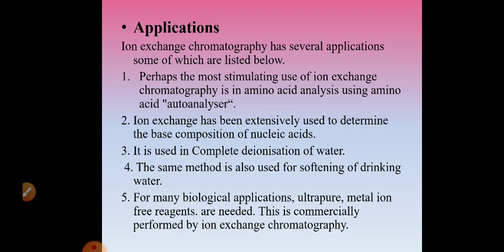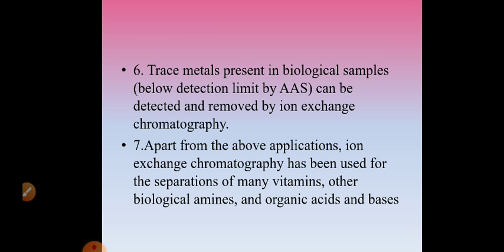Then there are certain biological applications or reactions where ultra pure metal ion free reagents are needed, and these ultra pure metal free reagents can be commercially obtained by ion exchange chromatography.